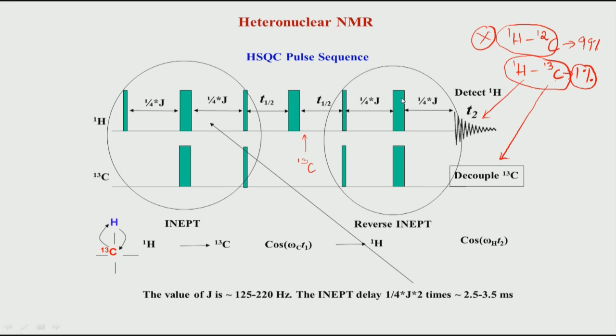So this experiment captures many of the details of a typical heteronuclear NMR experiment. Although we are not going to do this in this course, you can also use these ideas to design a 3-dimensional experiment, an n-dimensional experiment, because these blocks we are seeing are called building blocks. You can put together n number of blocks depending on what experiment you are doing, and design new experiments.